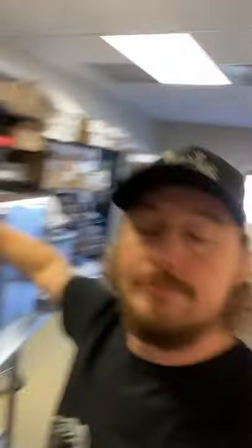A Flowhood is actually just a clean room fan filter unit. It's a 99% pure HEPA filter, as you can see right here, with a pre-filter and a giant blower. At its base, you can build a laminar Flowhood by going and getting a filter, building a box, and adding a fan.